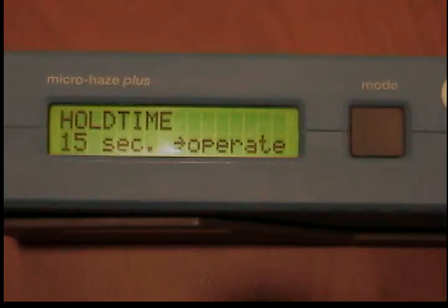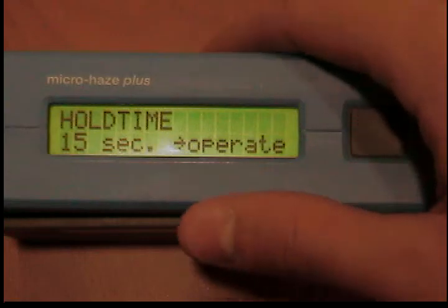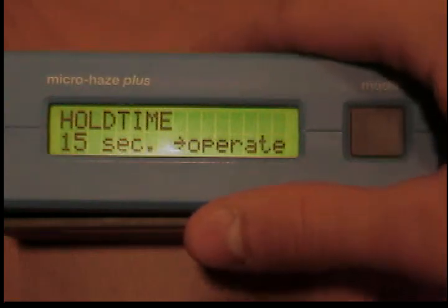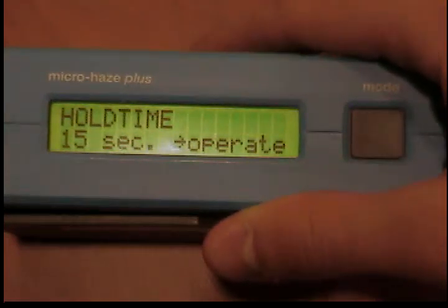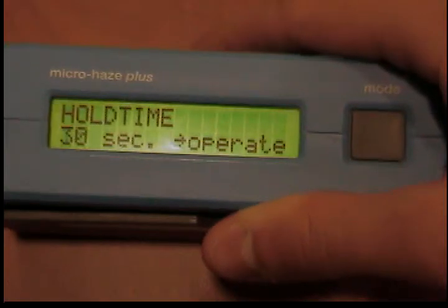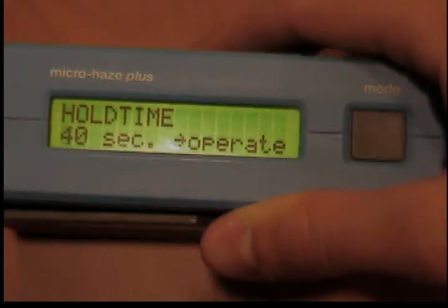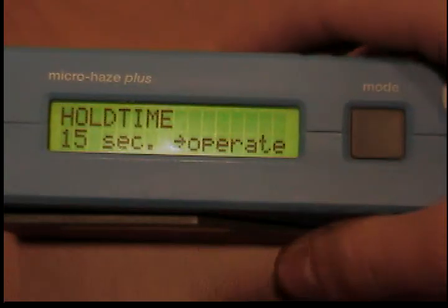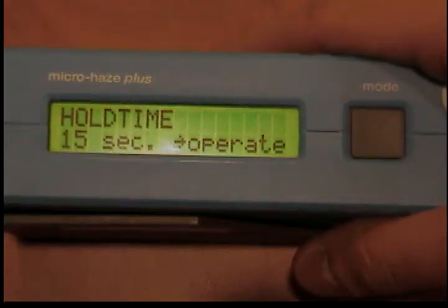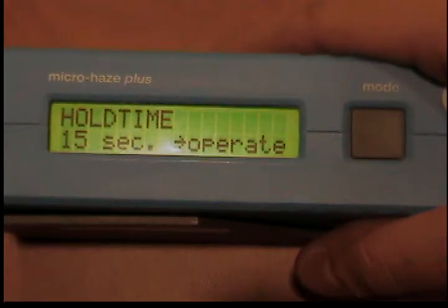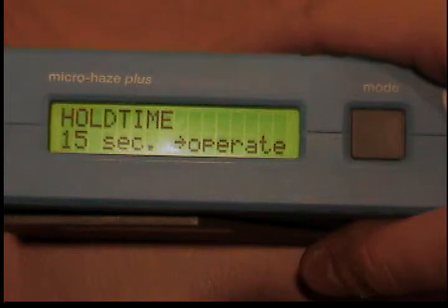Changing the hold time. If no other buttons are pressed within a selectable hold time, the unit switches off automatically. The hold time can be set for 15, 30, or 40 seconds. This feature helps to conserve the battery. When switching the unit on the next time, the last selected measurement mode is activated again.